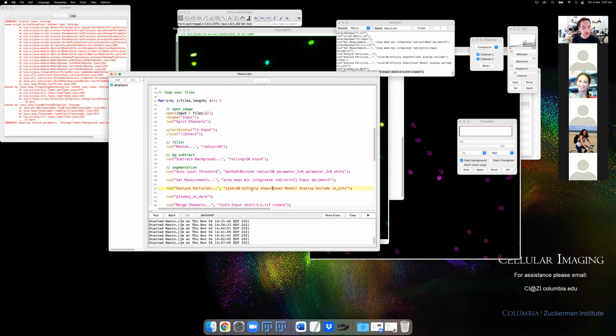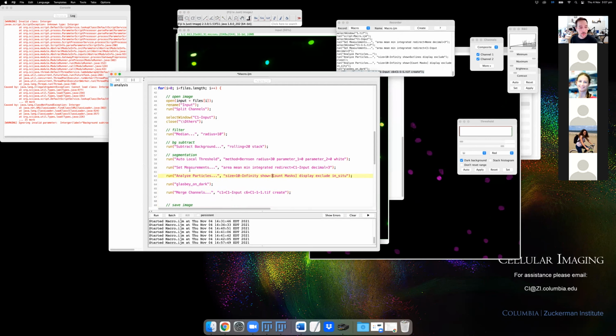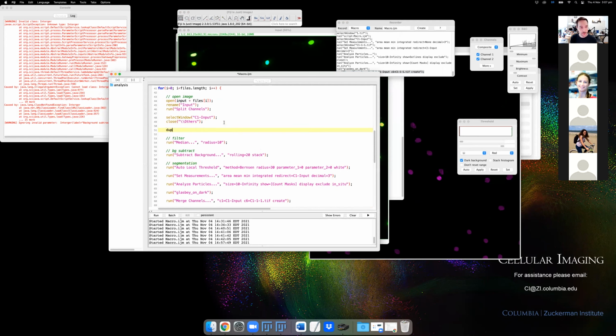All right. So it's good to give these names. So what I would do is, we're opening up the image, we're splitting it, we're running some filtering. Okay, so straight away we're filtering it. I would actually duplicate the image at this stage. So duplicate. If you're not sure what to type, let's just do an example.